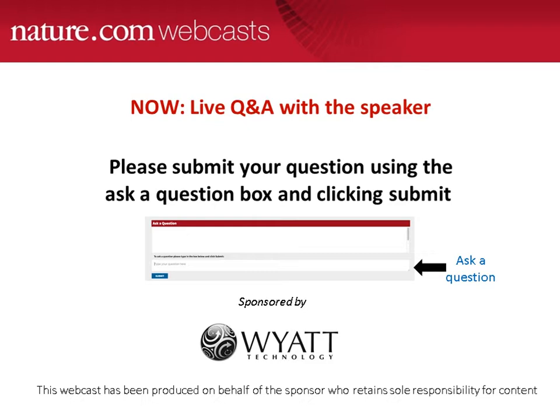there's a long email exchange before I accept something unusual. So I will research whether it will behave horribly on the sizing column. I'm mainly worried that things will not elute off the column, so there will be nothing to characterize at the end. That's my main worry. Other than that, I cannot even remember what I've analyzed. I've been doing it for 18 years, so I probably have seen almost anything that you can see.